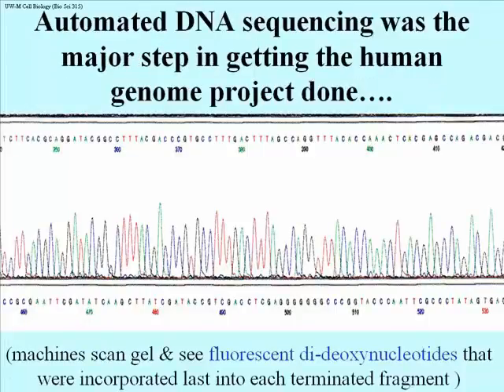The process became automated, so we don't need to go into great detail about how this automated sequencing is done, but basically it uses dideoxynucleotides that are fluorescent, and instead of running 4 different tubes, you run it all in one tube, and you put all the dideoxys in together with everything you need to make DNA, except that each dideoxy fluoresces a different color, and we have a big machine that detects the colors as they come off of a gel. It's still a gel. The neat thing about this system was where we would do 300 bases at a time, manually doing actual X-ray film analysis, the automated sequencing could give us sequences of up to 500 and 600 bases, even 700 bases on a good night when the moon is full.